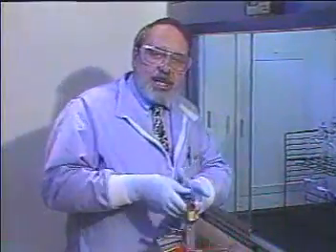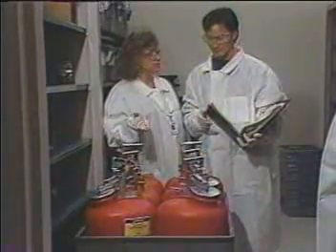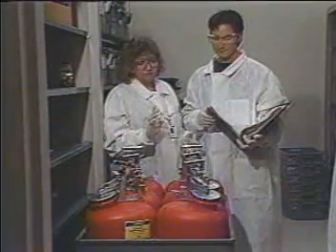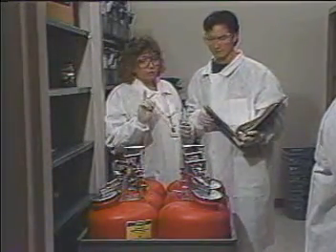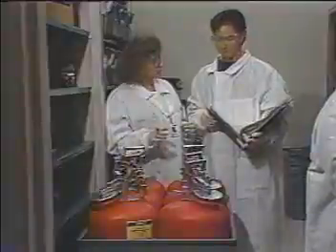Disposal of waste products can be tricky. Remember to take all the necessary precautions. Ask your supervisor or safety officer about federal and local regulations. Your company has a complete plan on how to dispose of chemical waste. Very few materials can go safely down the drain. Water treatment plants cannot filter out all toxic substances.